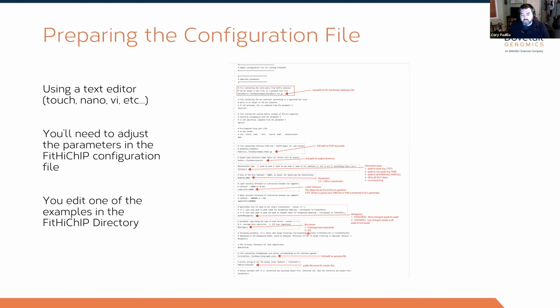Or you can use an iterative approach that's known here as ICE. I typically don't see a big difference when using these two approaches, so I typically default to coverage. Again, it's a much simpler statistic to understand, and we haven't seen it change the results in a fashion that really matters with the outcome.